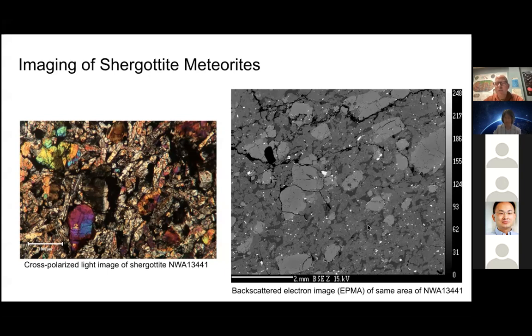In the case of the darker spots, like this one here, these areas are composed of minerals that contain a lower average atomic weight. And so we're looking at minerals with lighter elements. In this case, the mineral plagioclase feldspar. Now, in these two images, we're looking at more or less the same area. This crystal here with this kind of teardrop shape is the same crystal.